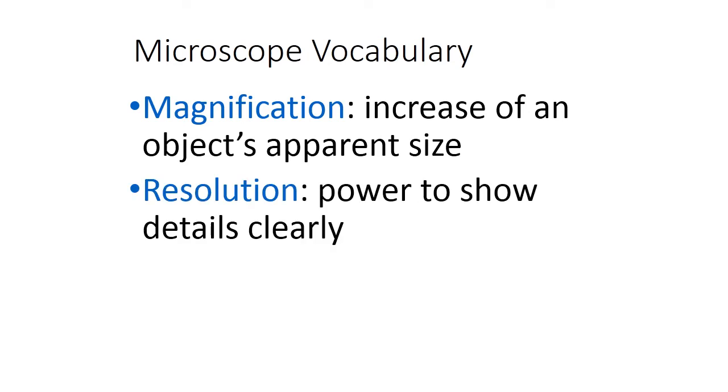Another important term is resolution, which is the ability to distinguish between two regions of a microscopic image. And this is important to show the details in a clear manner.